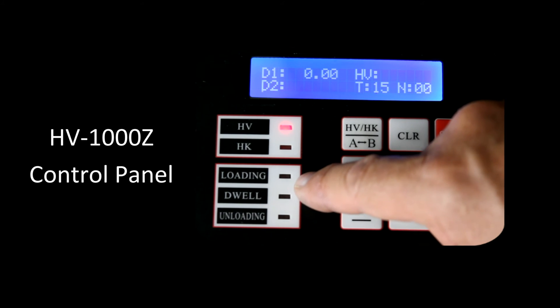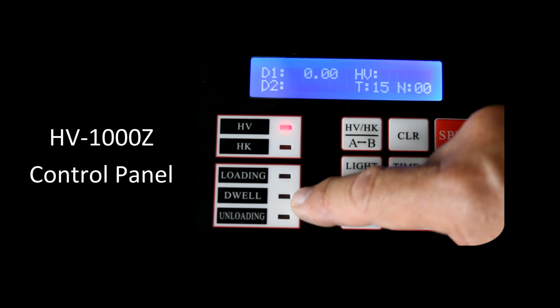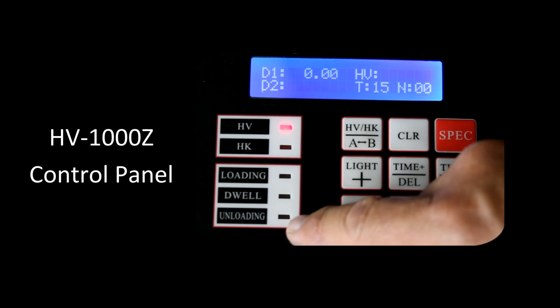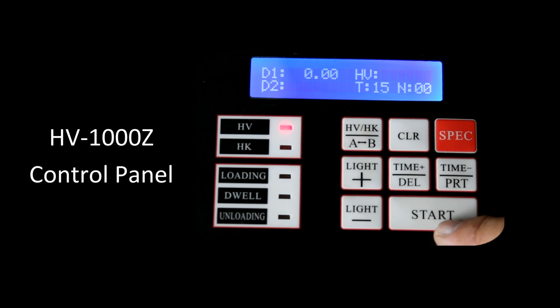Over here shows the progress of the indent. Once we hit the start button, it will show that it's loading the indent. After loading is completed, it'll show the dwell time counting down to zero. After that's completed, the light showing unloading will come on. During this time frame, we don't want to move the sample during the operation as that might damage the indenter. To start our measurement, let's go ahead and hit the start button.